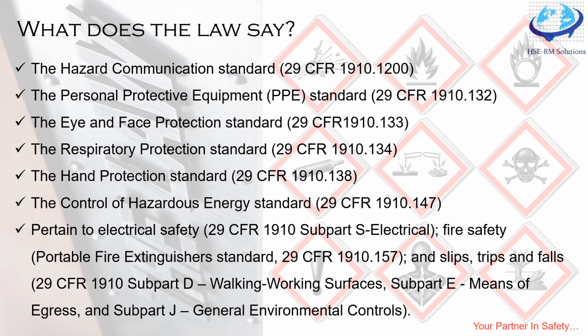is hazard communication. For any chemical industry or chemical area or lab, it is a must, or most important, that the hazards present in the area, which type of hazard and chemical is to be handled, are communicated, and how it's done. You can refer to GHS, that is the Globally Harmonized System. Now, to communicate quickly and effectively by GHS, what are the things to include? For effective communication there are many procedures, best suited as GHS, where one simply represents chemical impact with a picture and information of that picture to be available.